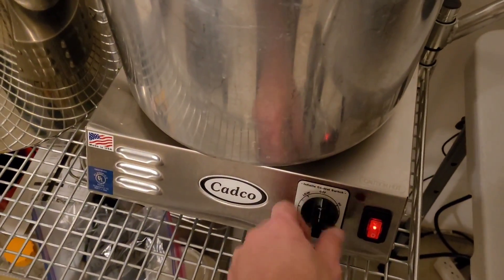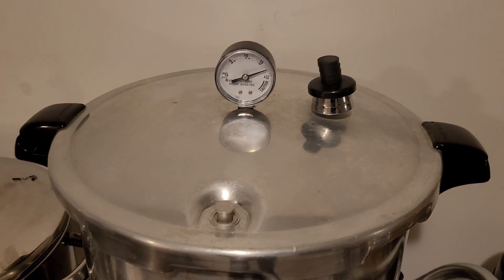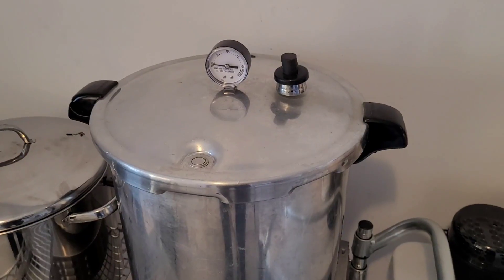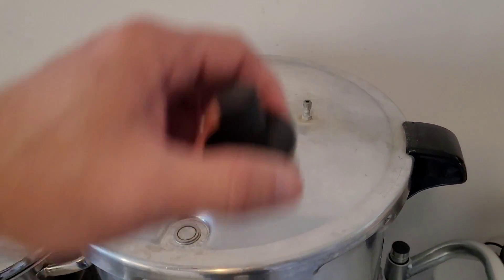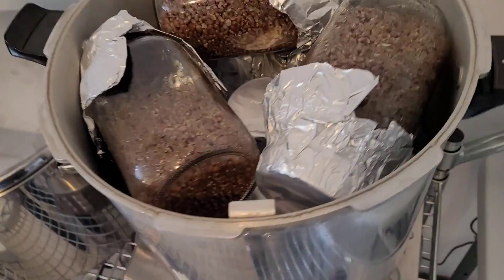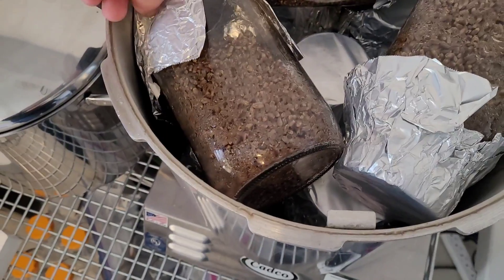Two hours is up — now just let this naturally cool overnight and take your jars out to work with the next day. It is now the next day; it's been cooling overnight. This is where the foil caps come in handy.